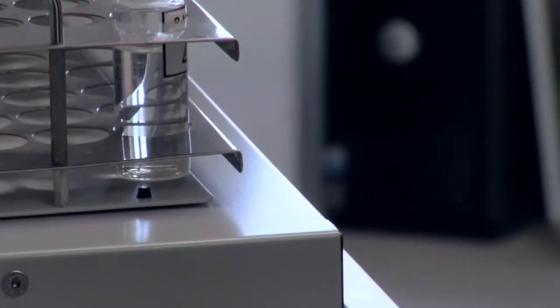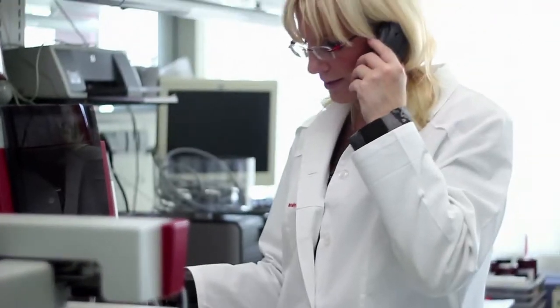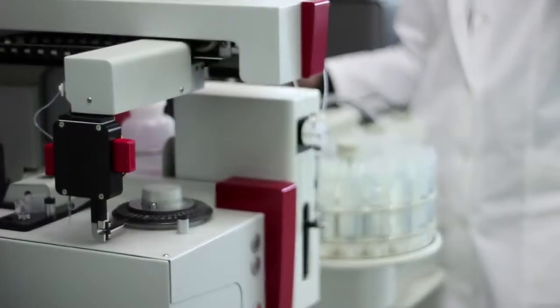With its top quality instruments and its highly skilled service and application support at any time, Analytik Jena sets the standard for future technology. Our worldwide network of authorized partners ensures superior and individual customer care. We offer the right premium instrument for any application.